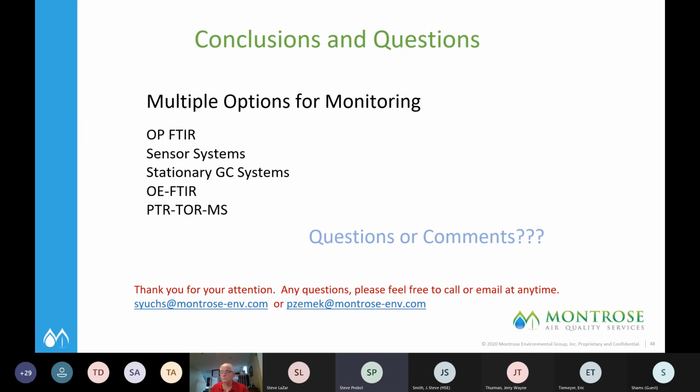What is the cost of this type of MS instrument? For the PTR, I believe it was 600,000 for the instrument alone. And the entire setup ends up in the very high six to low seven figures to get everything outfitted and equipped the way that we have it. It's not a cheap mode. That's correct, Steve. Yeah, we can build a van for about 800,000 fully equipped.